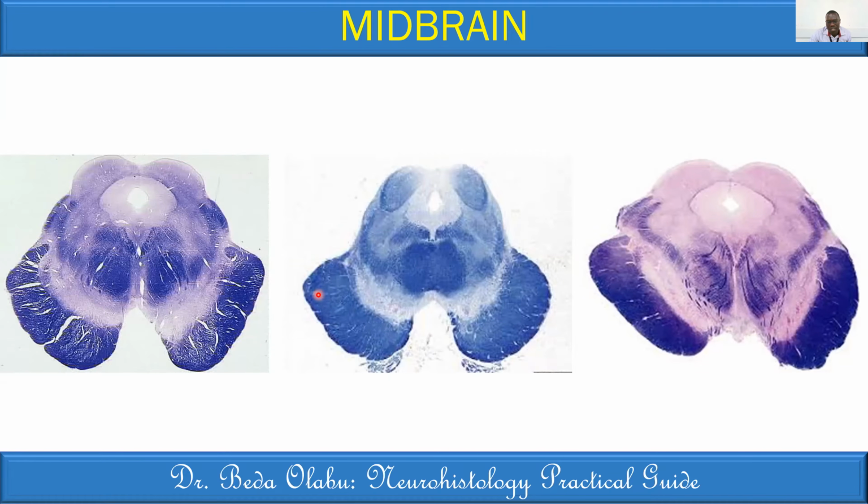The lateral 1/6 carries fibers from the cerebral cortex other than frontal cortex to the pontine nuclei. You can talk about parietopontine, temporopontine, and occipitopontine. If you take 1/6 here and 1/6 here, you remain with 2/3 in the middle.